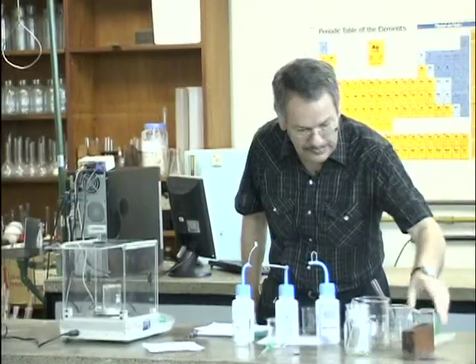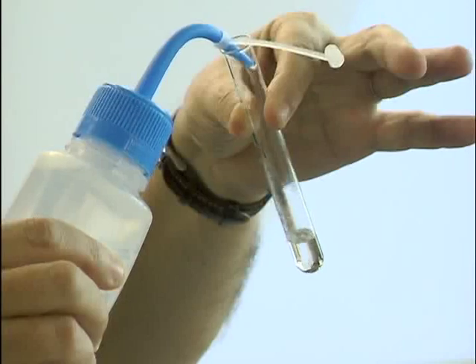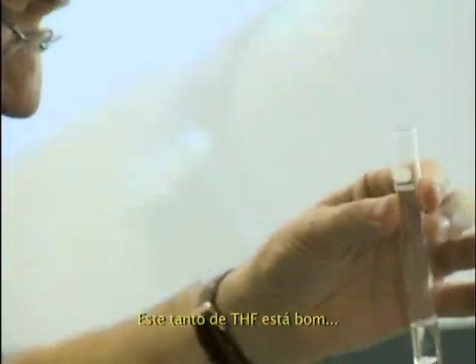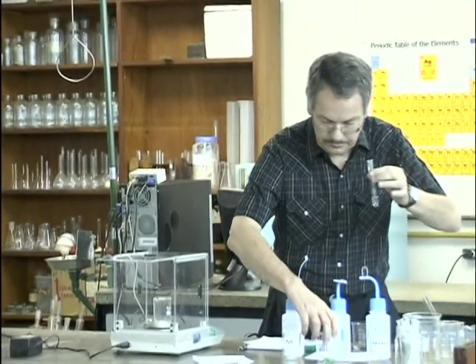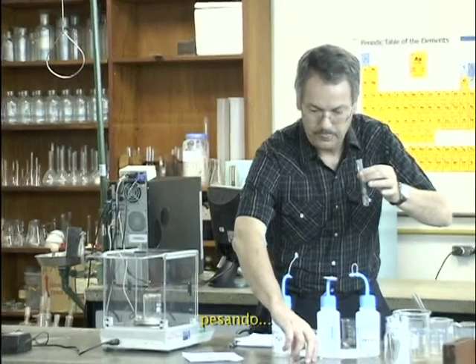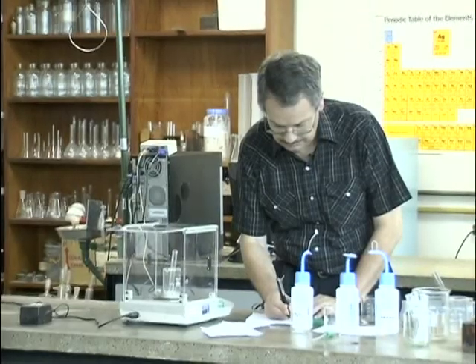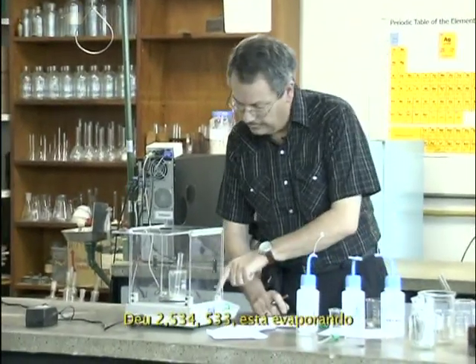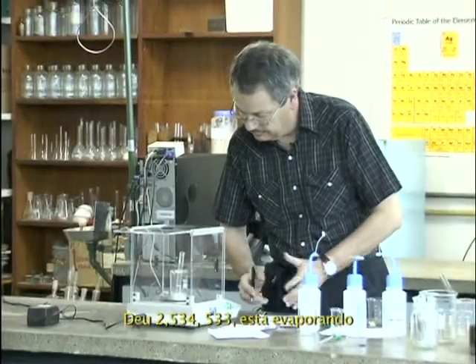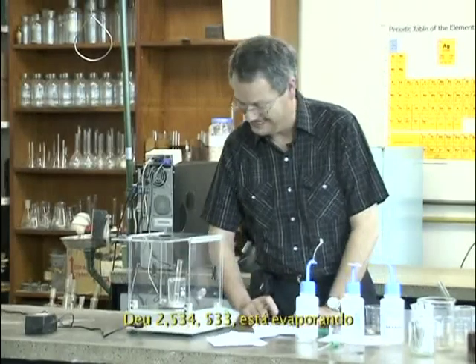There. And I take a second tube. This much will do. THF. I put this one, weigh it, write it down, and I read 2.533, it's evaporating.